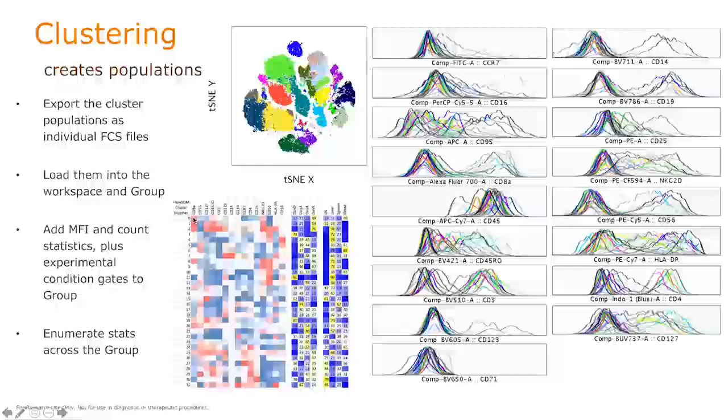So now going into Excel, I can just heat map each column from high to low, red to blue, and immediately see what clusters express what given marker, apply that to each column. And then over here on the condition gates, I'm actually applying a different color palette across the row within the group of gating here. And so this is my time course, this is my compartments. And you can easily see just with the color coding, I hid the numbers over here, I left them over here. You can see that some populations start low, they go up and then they go down. This is a time course of response of a treatment.